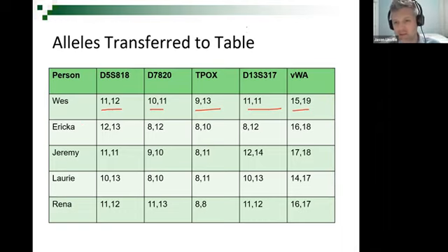This is a little bit confusing. This specific section, like I said, is not in the book, but I think if you read the book along with the previous lectures, it helps visualize what's going on. And that's really the important part, that you can sit and visualize in your head: after amplification, I got 10 million copies of this allele, 10 million copies of this allele. Now I'm going to add some information.